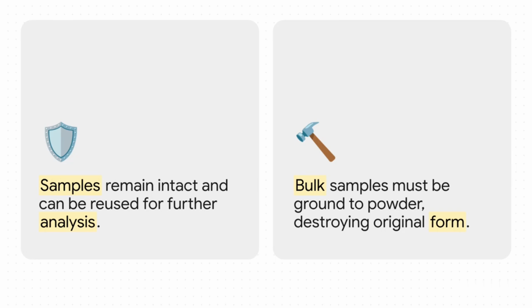Well, there's a catch when it comes to sample preparation. To get the absolute best, cleanest data, bulk samples usually need to be finely ground up into a homogeneous powder. So while the X-rays themselves won't destroy the powder, the actual act of preparing the sample might require you to fundamentally destroy the original form of your bulk object. It's a kind of ironic trade-off you always have to keep in mind.